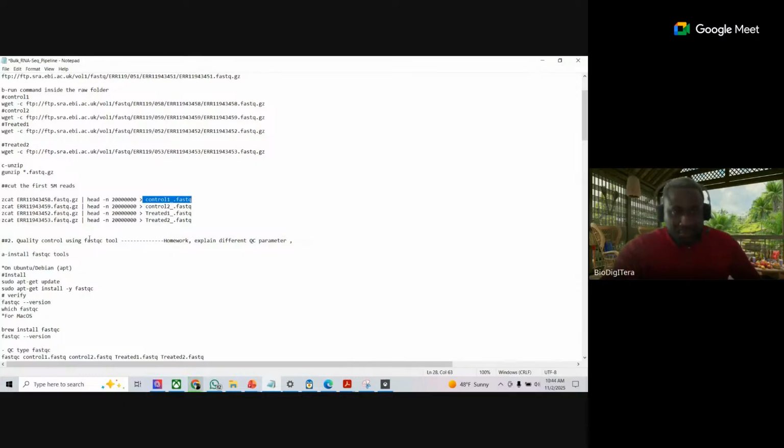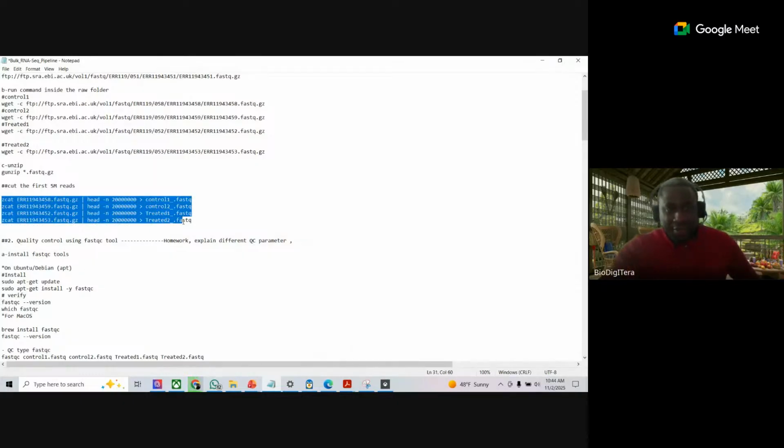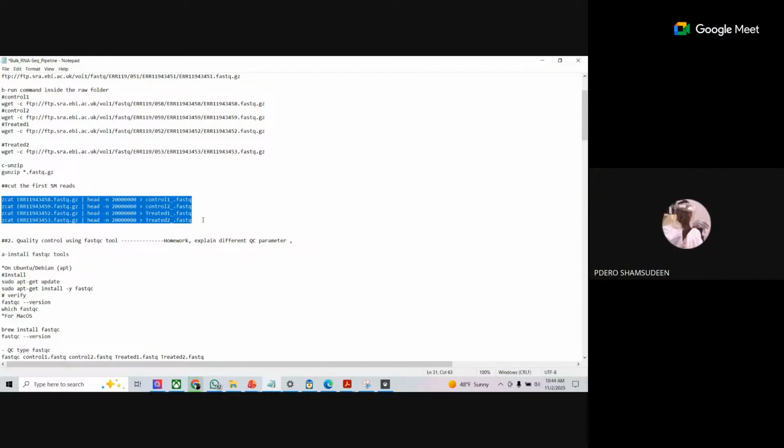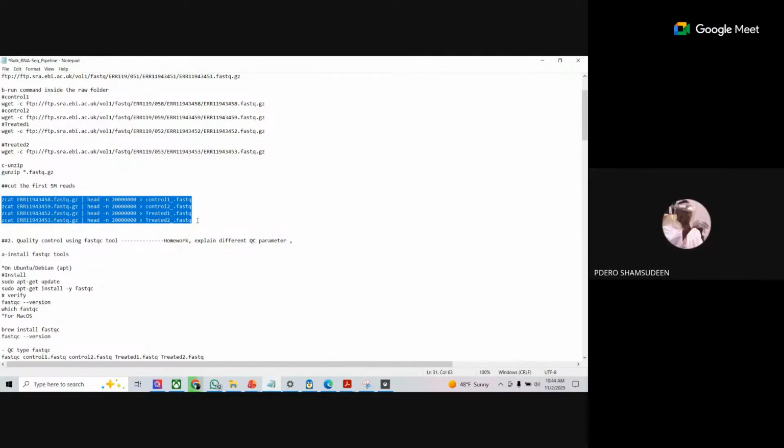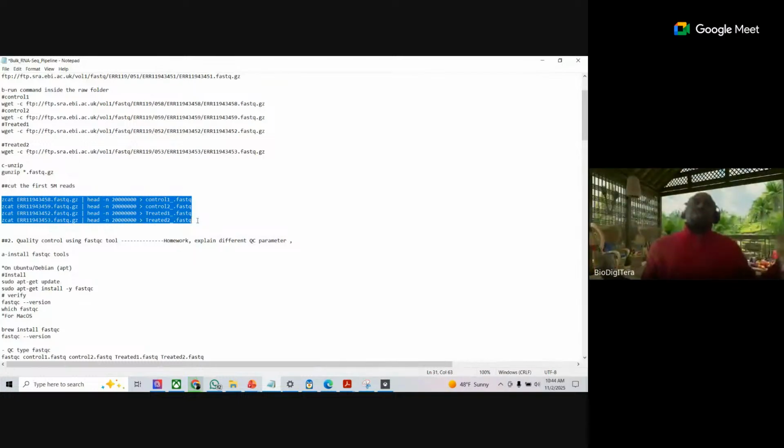Is it okay for everyone? Yes, sir. But I have a question, sir. How do you get to know the region you are going to copy? Or is it always the first 5 million? No, it's not always 5 million. It depends, you already know the size of your file.